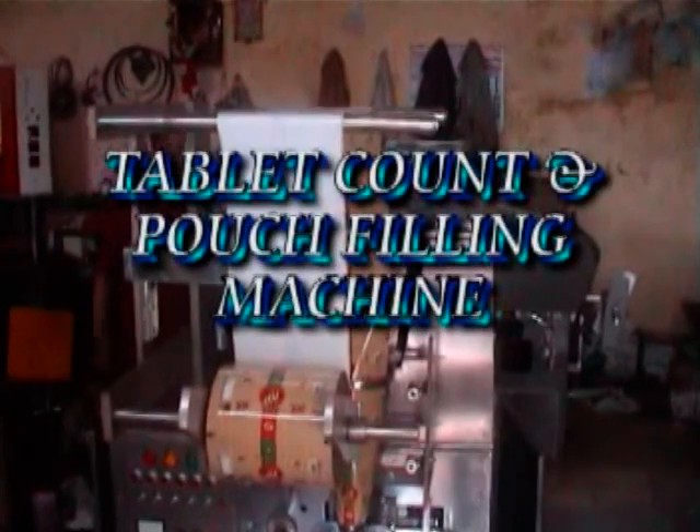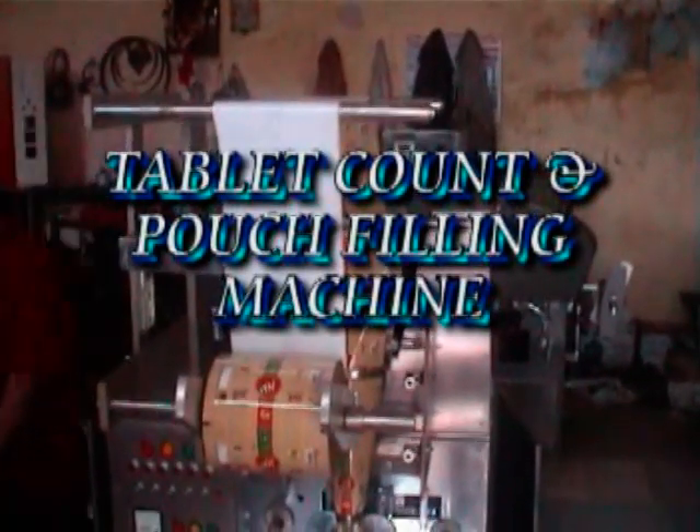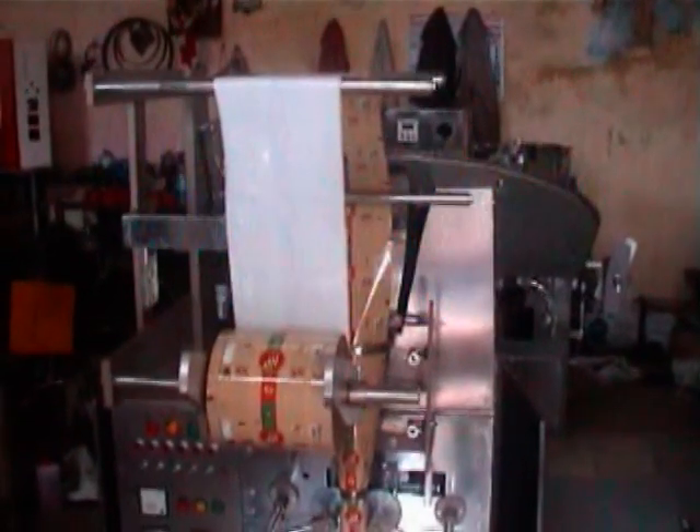You are seeing the tablets counting and pouch filling machine.